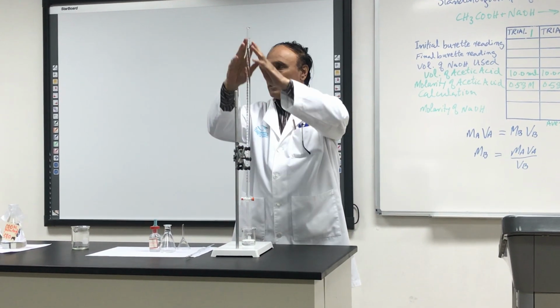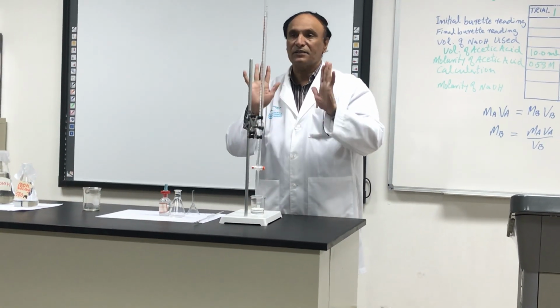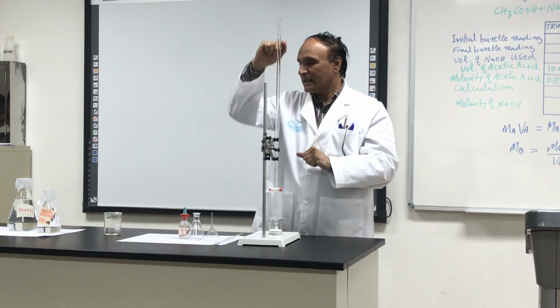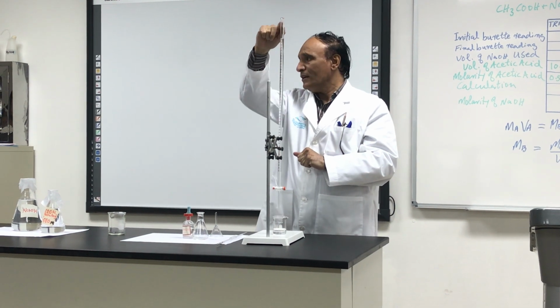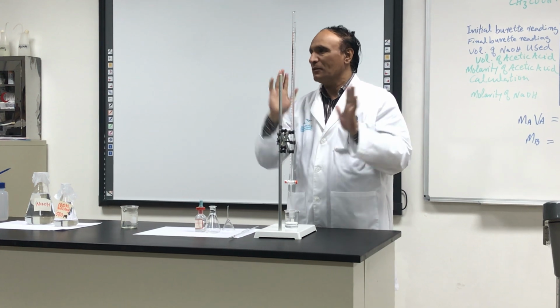Okay. So the whole burette is filled with sodium hydroxide, and up to here there is sodium hydroxide. Before I put above zero, then if you don't understand, ask me. Before I put above zero, then I open it, and now any point below zero.